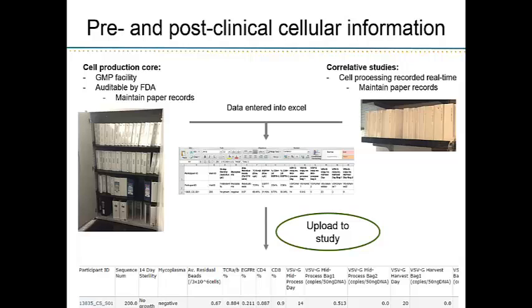They have about 4 of these, plus more in private rooms that nobody's able to access. So it's a lot of data that has to get manually entered. Our team also has a few paper-based systems, and the reason for that is that we're taking these cells in and processing them in the tissue culture room, and we don't have tablets or computers in there. So in order to record this information in real time, we're doing it on paper.